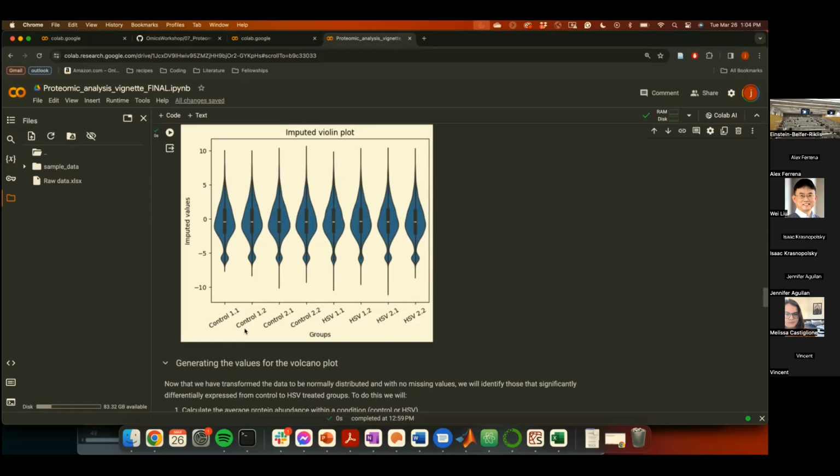That's why, obviously, wherever you put an imputed value is always wrong, because it's imputed. But the reason we put them there is because it's a reasonable statistical estimation of what is the background noise of our data.